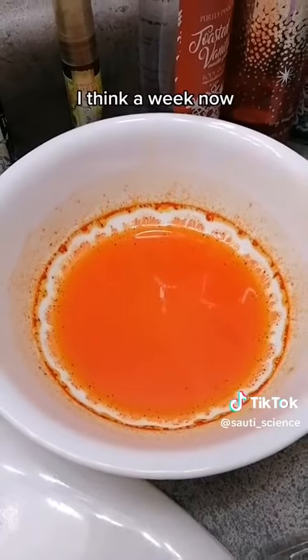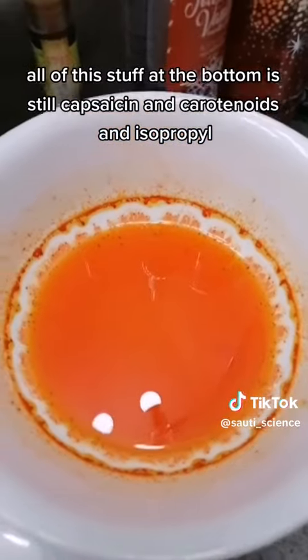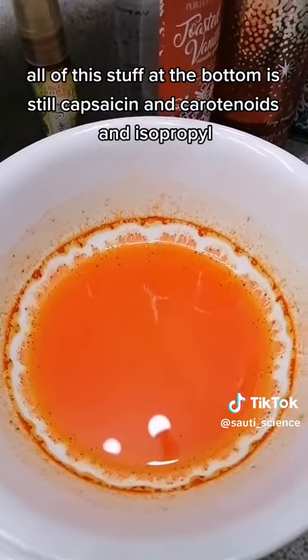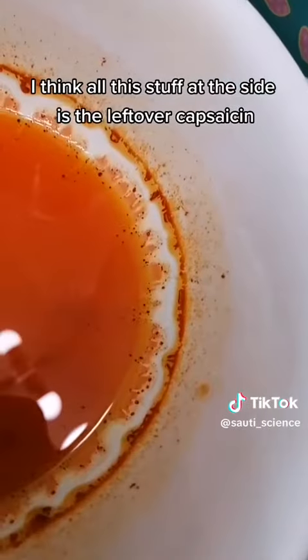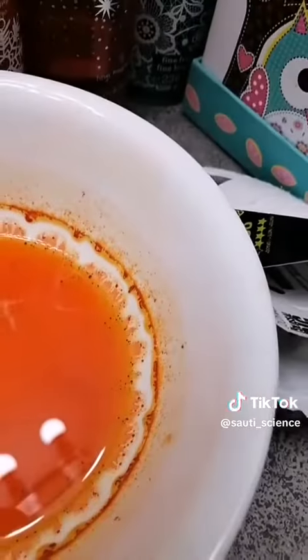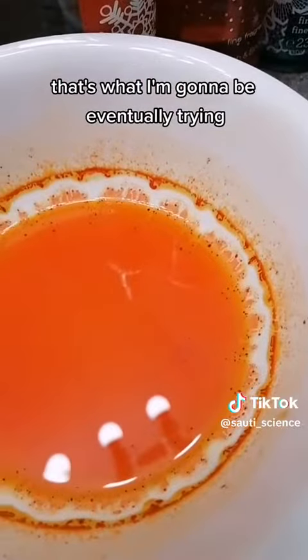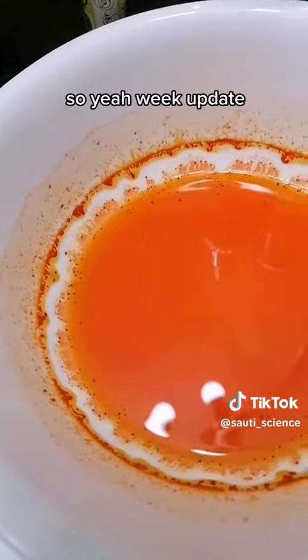We're at about a week now. All of this stuff at the bottom is still capsaicin and carotenoids and isopropyl. I think all of this stuff at the side is the leftover capsaicin, so that's what I'm gonna be collecting — that's what I'm gonna be eventually trying. Week update.